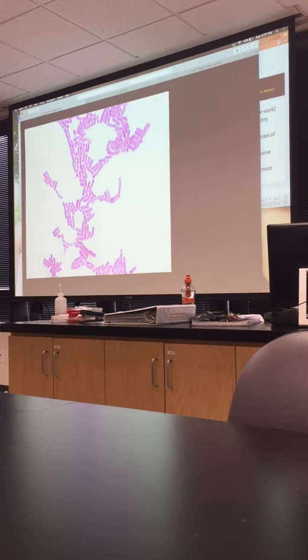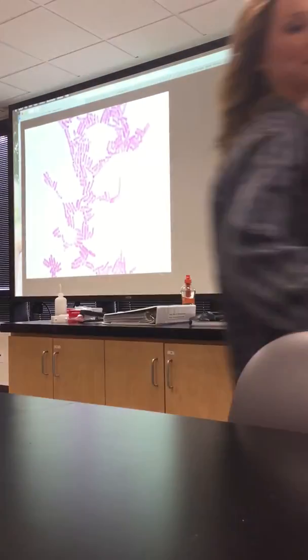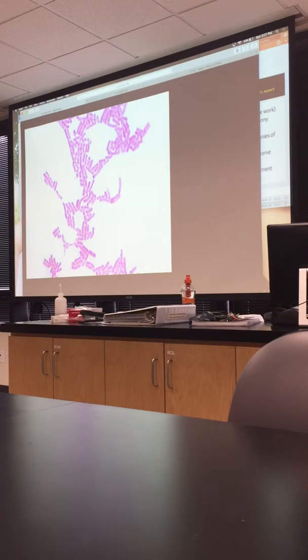Yeah. Same thing. I'm going to steal some lens paper since I did oil. There's some right here. You've been here the whole time? Thank you. I just need these. I think there's many people. Okay. Yeah, that's what I was thinking.